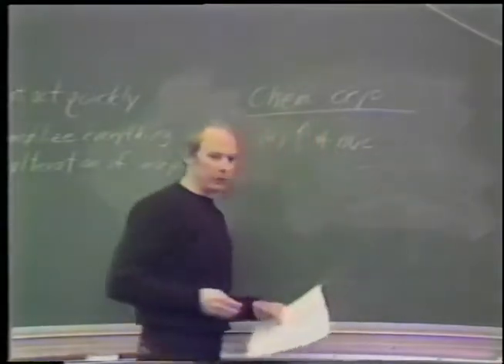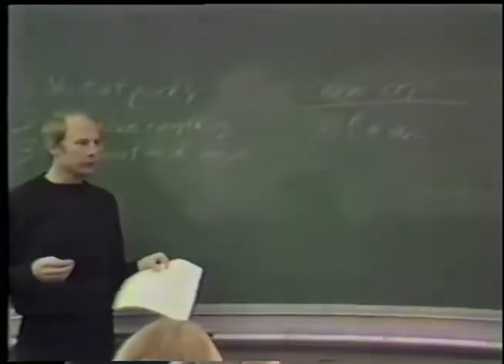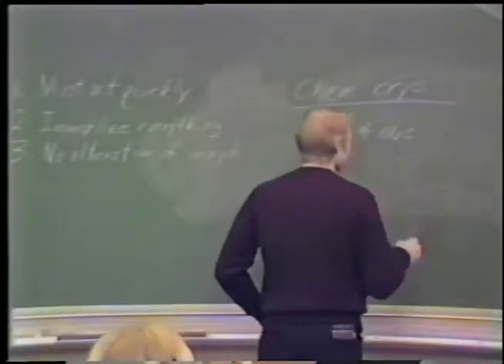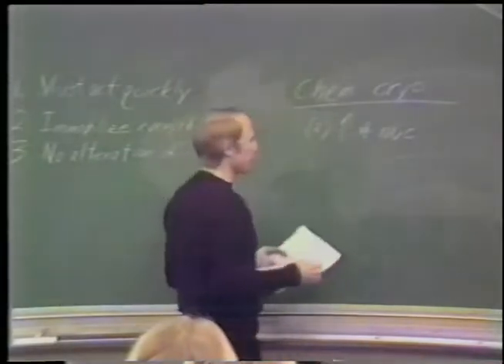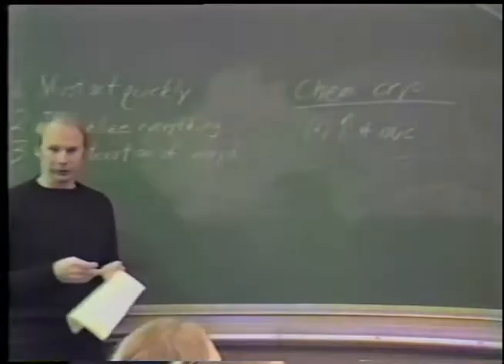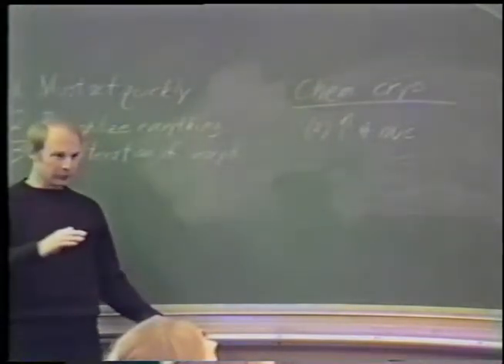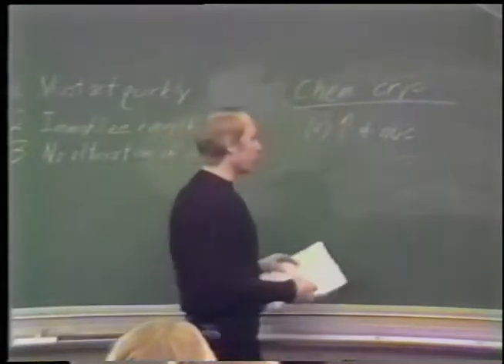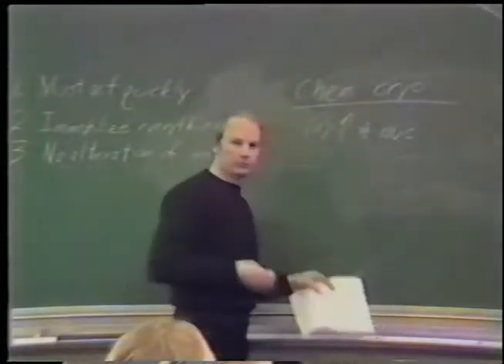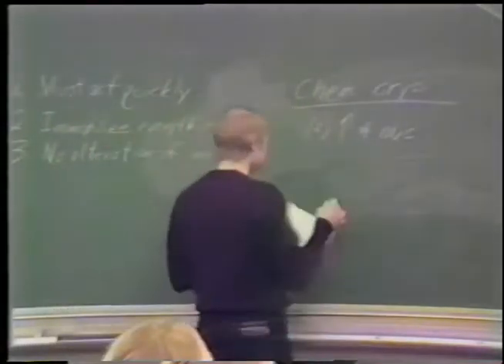The more nuclei there are, the more sites there are for the water in the system to migrate to. What this does is it gives rise to a large number of small crystals. The fewer nucleation sites there are, the more large crystals you can grow. But if there are lots of nucleation sites, then all the water gets tied up relatively quickly in lots of sites. So the ice crystals are very small. There's not much damage.